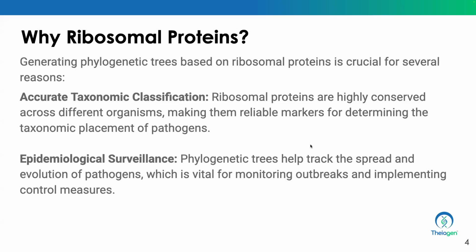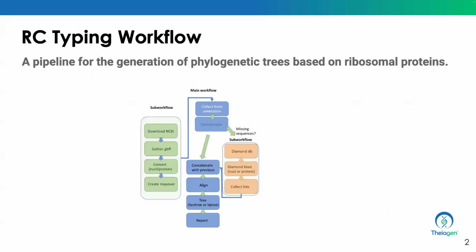So, the reference, good question. If I can just go back before. The reference protein actually does come in because, think of it this way: you have your sequence and then you have the reference. You use the reference protein as a way of blasting or identifying the complementary sequences from your particular set of assemblies. I don't know if that makes sense, Rotin. Yeah, thank you, James.